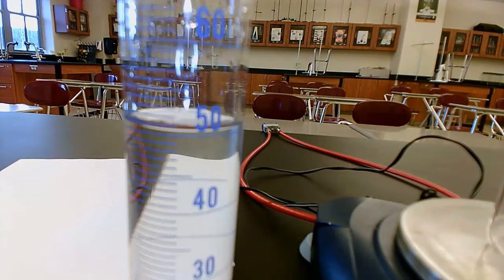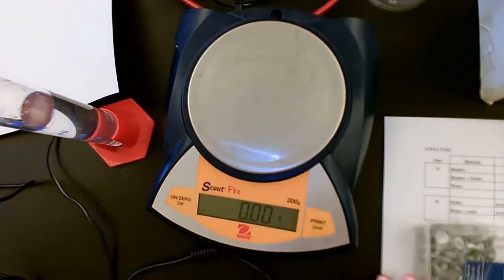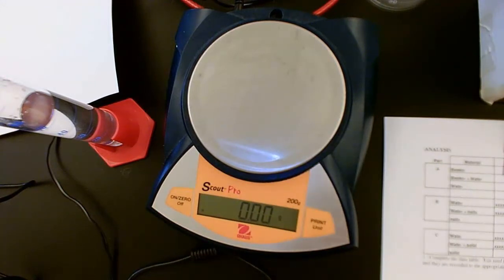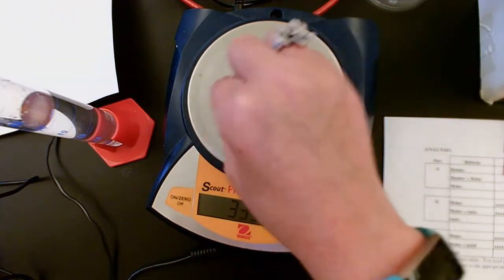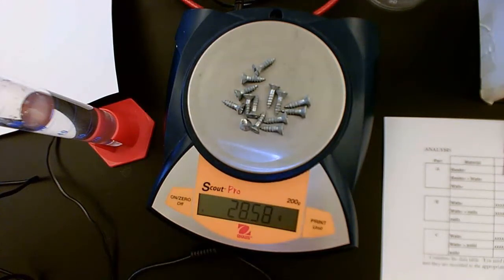So part B, it says, obtain a couple zinc screws. So I'm going to zero my scale. See my zinc screws? It doesn't matter how many. I'm going to put this many. You need to get the mass. We're on part B now. We're getting the mass of the zinc screws.